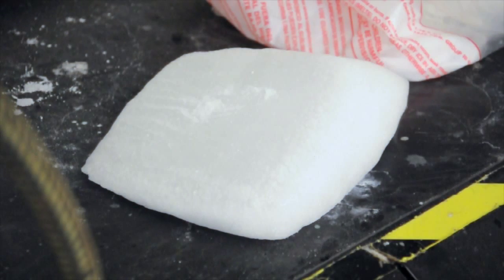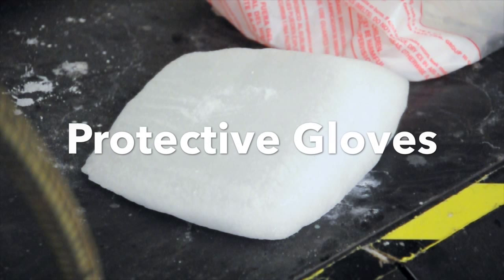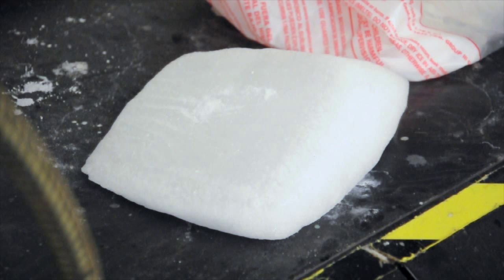The materials that are needed are dry ice, magnesium scrapings, gloves for protection, a chisel for carving into the dry ice, and a burner for igniting the magnesium.